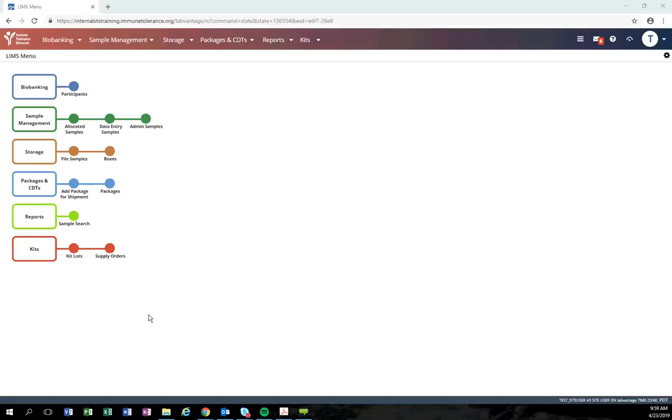Welcome to the ITN supply order module demonstration. Today we will walk through the steps to enter a new supply order within the lab vantage application. Upon logging into the application, you'll see the new supply order module located on the kits tram line.